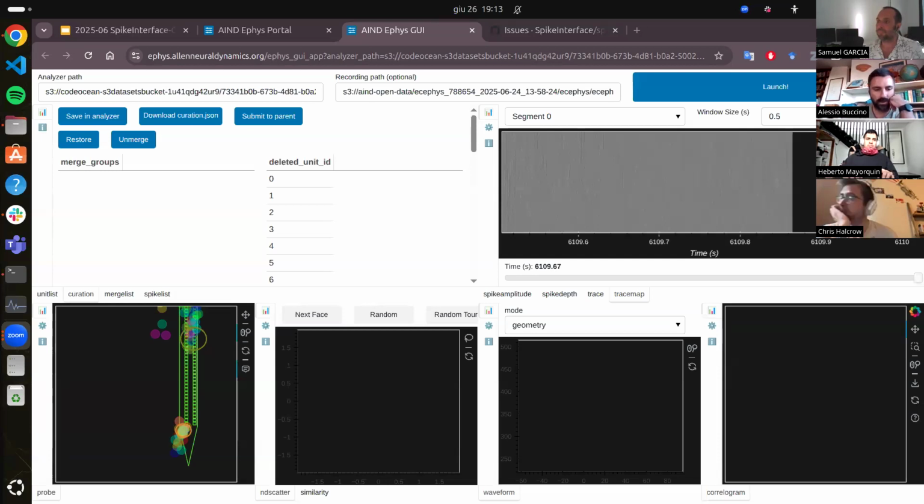So there's another question from JT, and maybe Chris, you want to take it since you're working on making the entire pipeline shank friendly. Yeah, so the question is, can you handle multi-shank probes that were sorted shank by shank? And the answer is the GUI, yes, definitely can handle that. And SpikeInterface very soon will be able to handle that incredibly nicely.